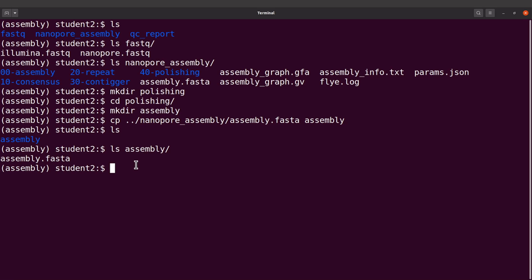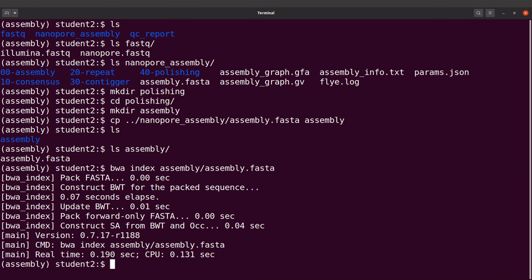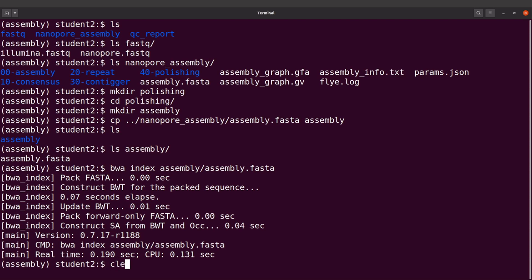We are now going to index this assembly file because it's going to serve as our reference sequence. We'll use BWA. So I'll say: bwa index assembly/assembly.fasta. Let's run this command. Okay, indexing has been done. So now we are going to map the short reads to this assembly file. Don't forget that this assembly.fasta was generated using the long reads, so we are going to polish it using the Illumina reads.